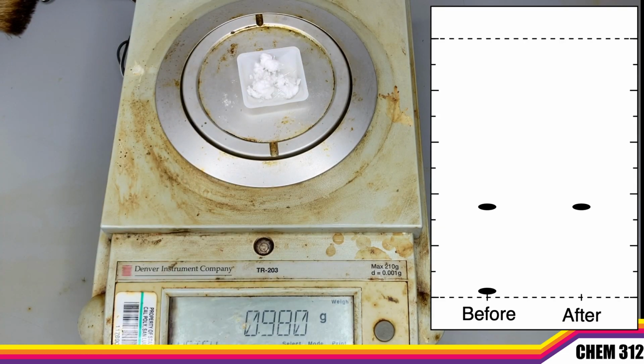All right, so after I've gotten all of my recrystallized solid off my filter, I can see that now the mass is 980 milligrams. So your task is to figure out how much of this compound was re-isolated and what our percent recovery is. How much of the solid were we able to get back out of solution?